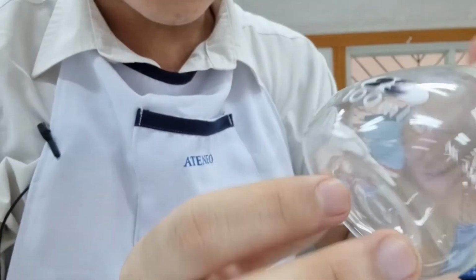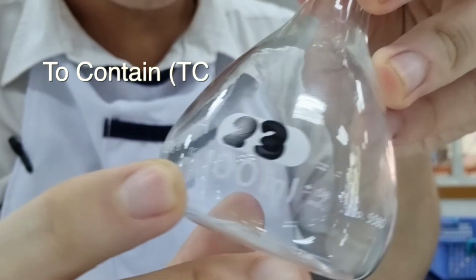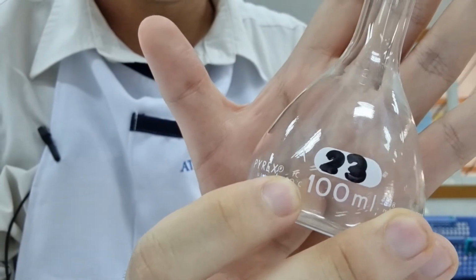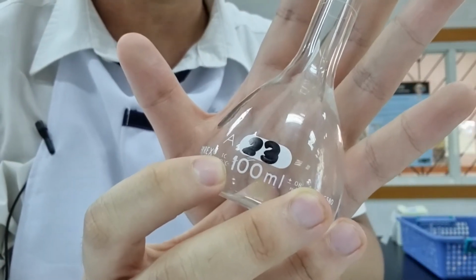If you could also see, it says here it's TC. Can you see it? TC. TC means to contain. That means if we measured up to the mark, it will contain 100 ml.